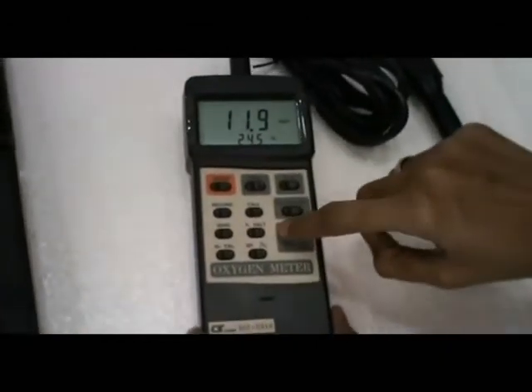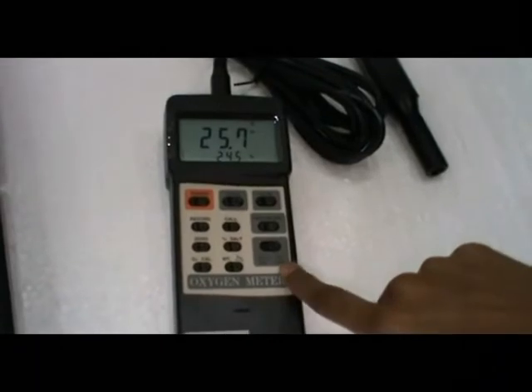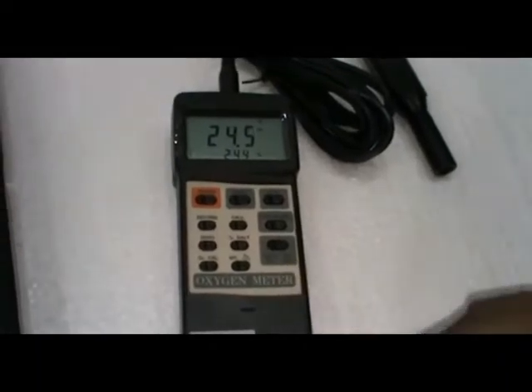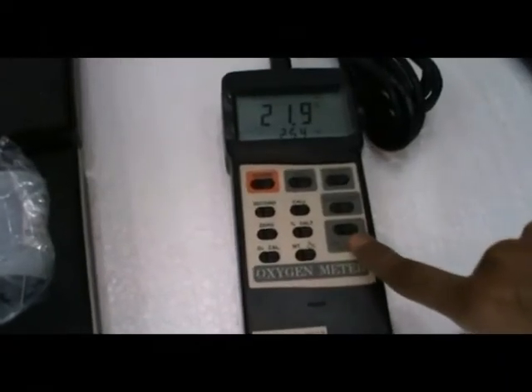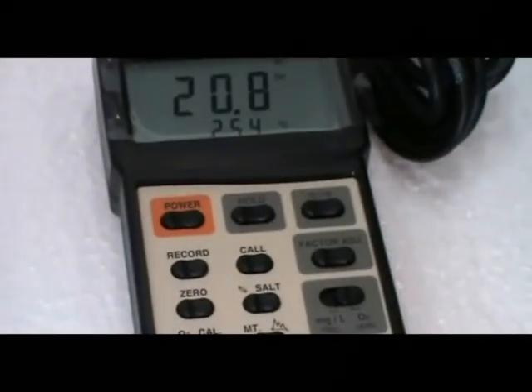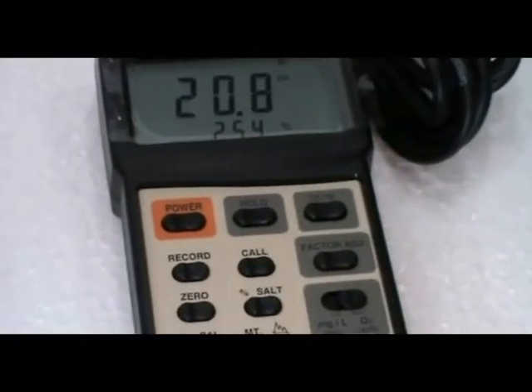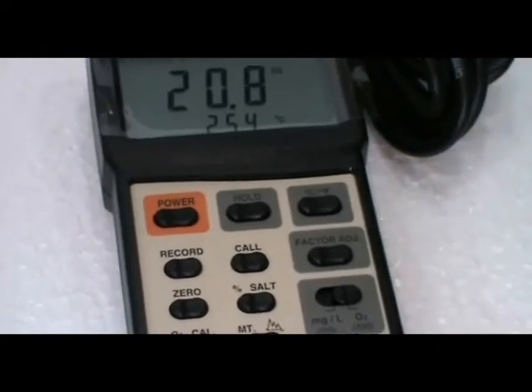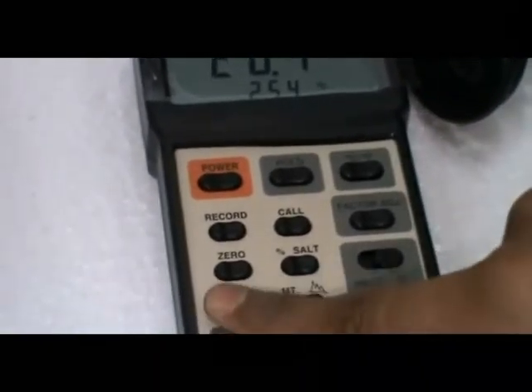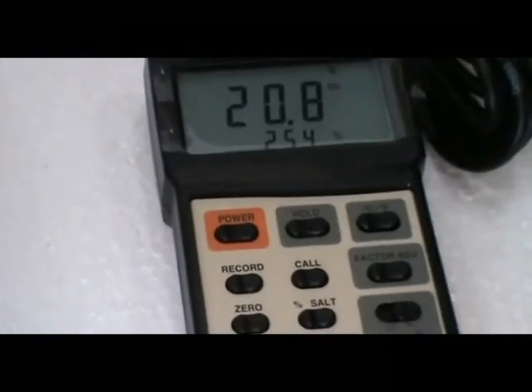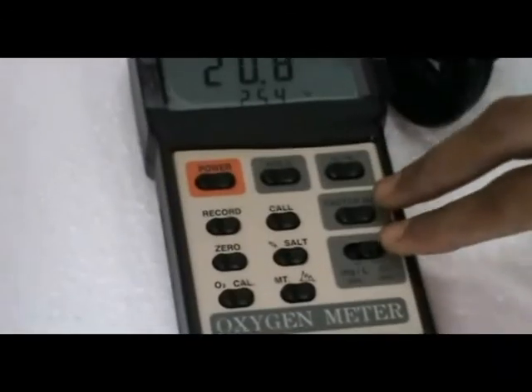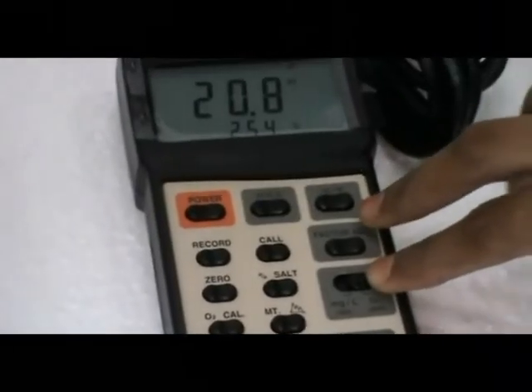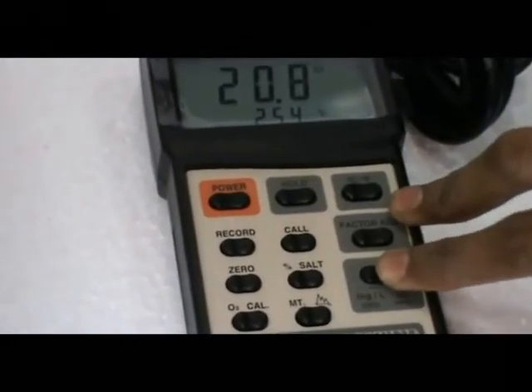Change the mode key to O2 air calibration. In this air calibration mode, change to milligram per liter.